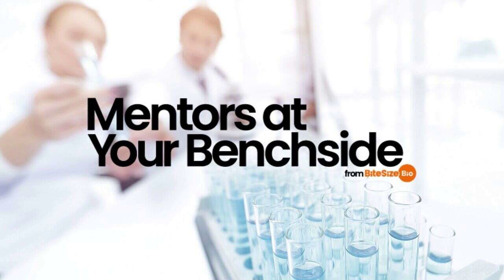This is because unstained tissue lacks contrast. All of the fixed materials have a similar refractive index and a similar color. If you viewed an unstained tissue section under the microscope, everything would appear a uniform, dull gray color. The staining process therefore makes use of various dyes that stain particular cell components within tissues so that you can distinguish different cell parts from each other.